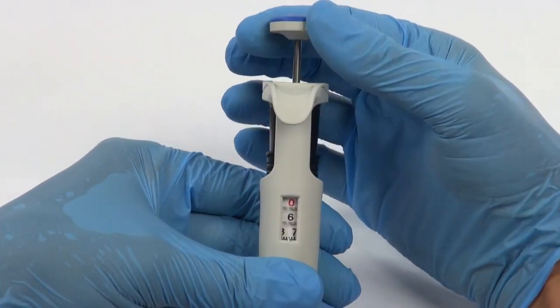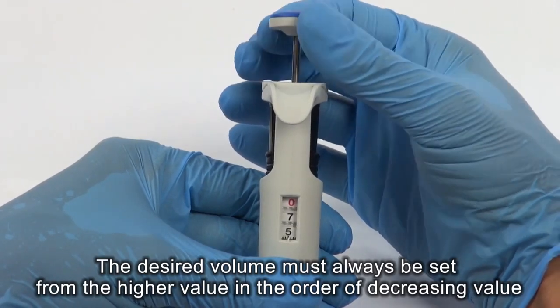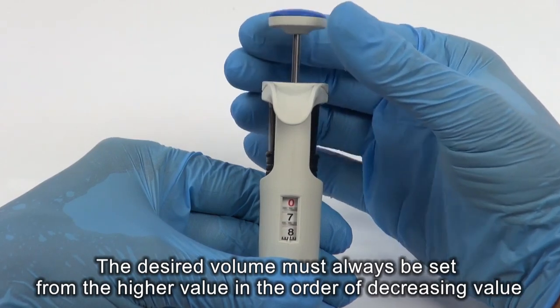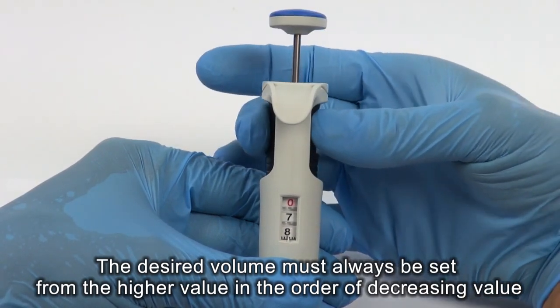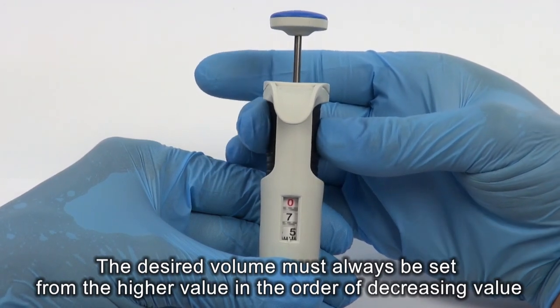If the desired volume is higher than the set volume, turn the pipetting push button, increasing the value until the lower figure wheel comes one third of a turn beyond the required setting, and then slowly backward.